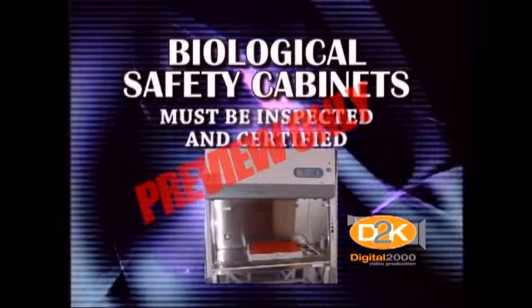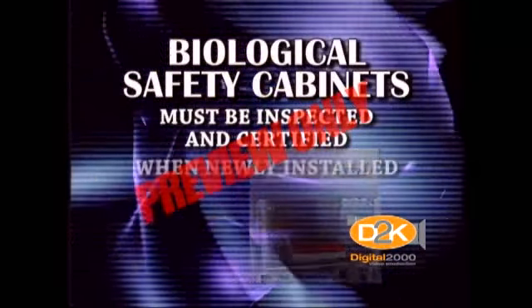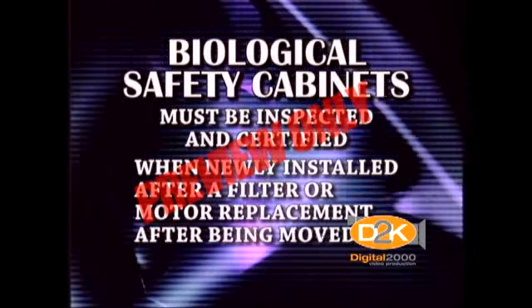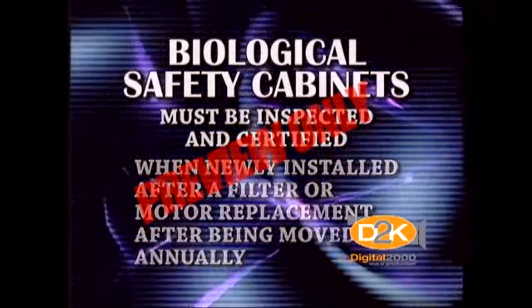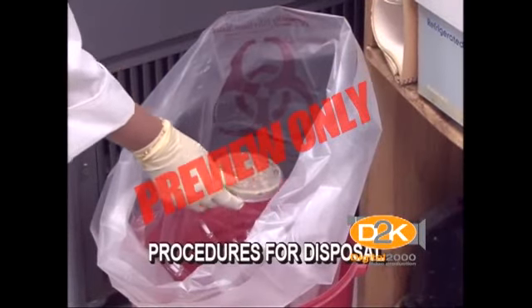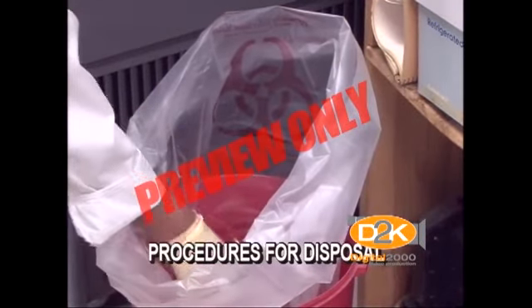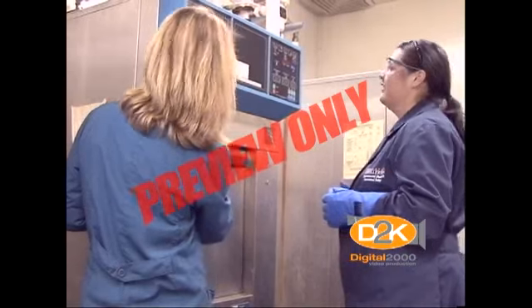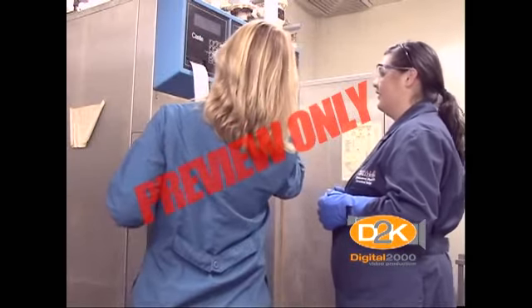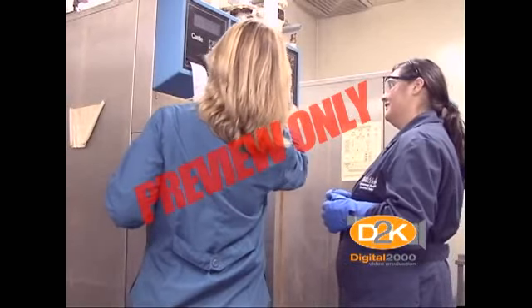Biological safety cabinets must be inspected and certified when newly installed, after a filter or motor replacement, after being moved, or annually. Biological waste must also be managed in accordance with state, local, and federal regulations. It is industry standard to disinfect solid and liquid biosafety level 1 or non-biohazardous waste.